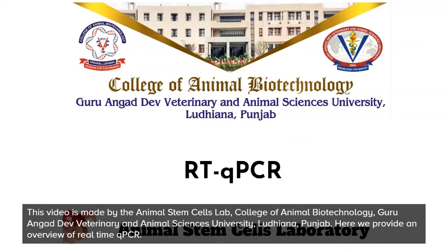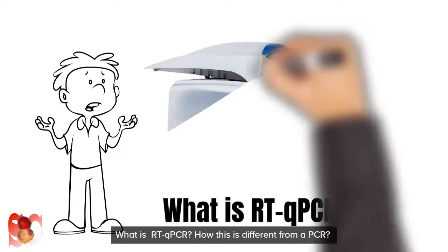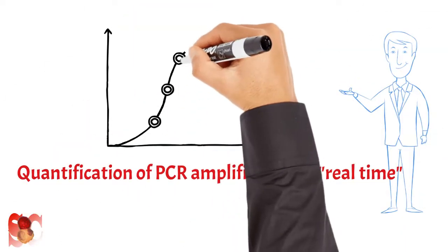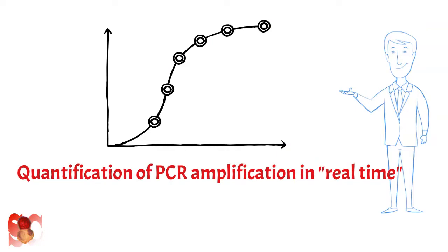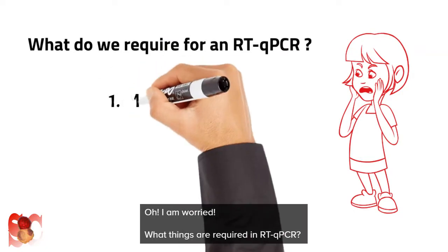Sciences University, Ludhiana, Punjab. Here we provide an overview of real-time qPCR. What is RT-qPCR? How is this different from a PCR? Quantification of PCR amplification in real time. Oh, I am worried. What are things required in RT-qPCR?